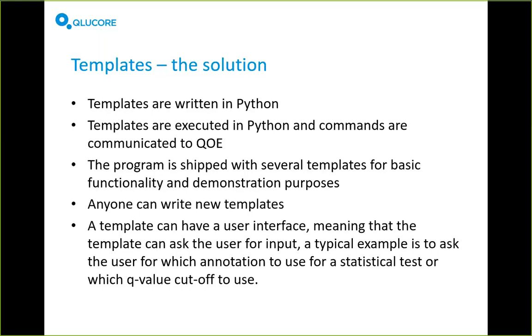Another cool thing with templates is that they are not just a script file. They're actually a little container, because a template is really a zip file which can contain other files. So the template can contain other resources as well. For example, if you have a data set that you want to ship to your colleagues as a template, you can do that, because you could put the script and the data set together in that zip file, and you could configure the script to bring up a series of plots and set up the program in a nice state to show what you want to show your colleagues. So it's a way of communicating things as well, potentially.